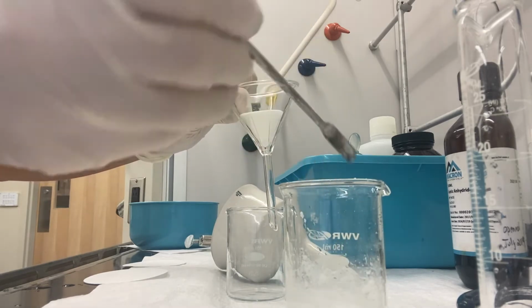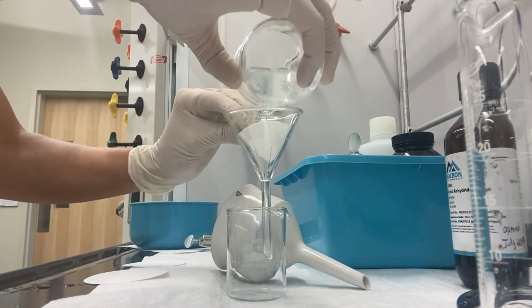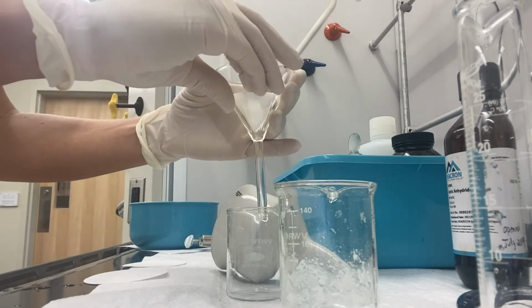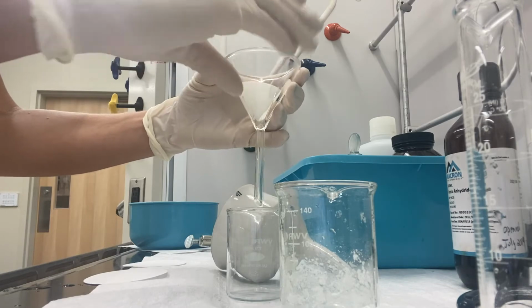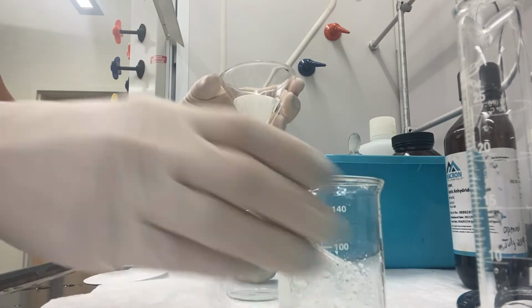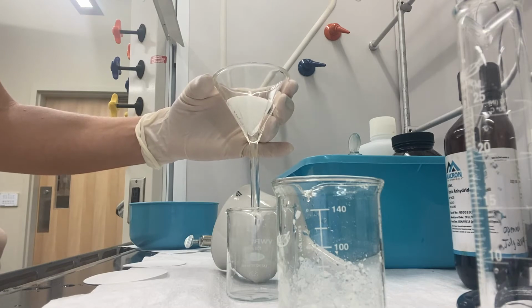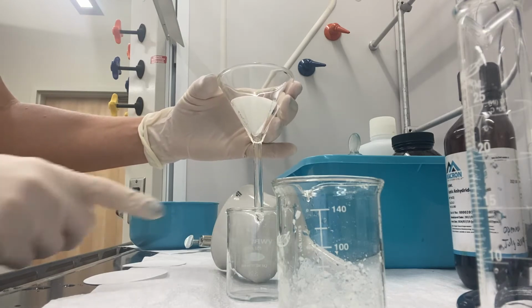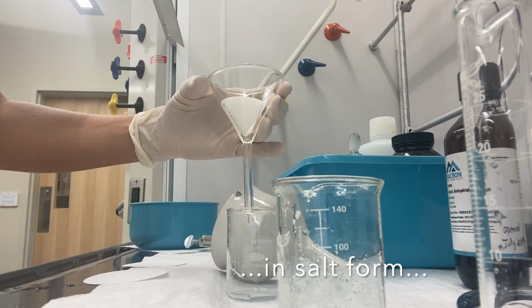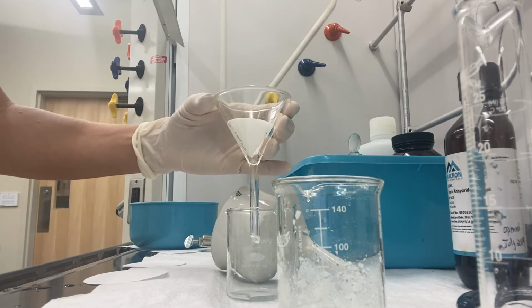So I'll just do this. And I'll pour my solution inside the funnel. And it may come out pretty slow. But it's our aspirin that's now in this aqueous solution. We've manipulated its carboxylic acid functionality to get it away from this impurity.